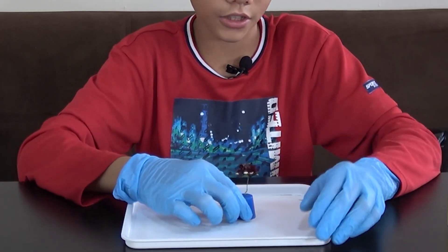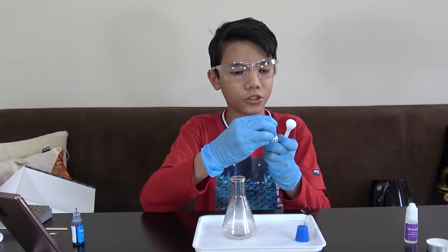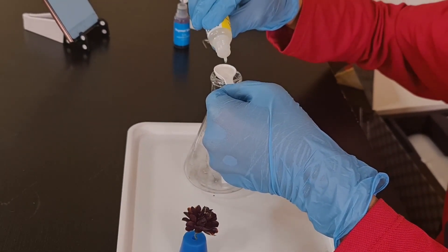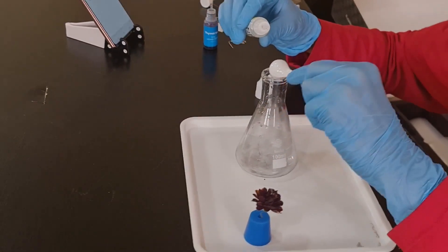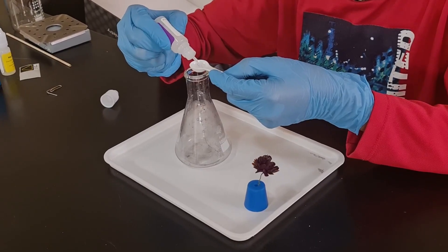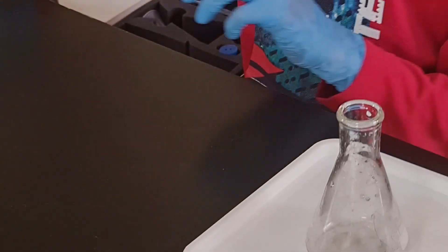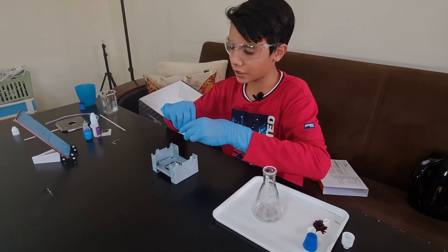I think that should do. Now I'm going to pour one big spoonful of disodium disulfite into the flask, and two big spoonfuls of citric acid — one and two. Now for the fun part: I'll open up the stove and put the candle on top of it.